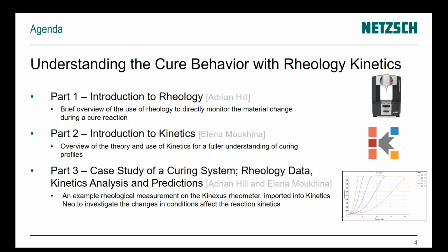So the presentation today, we split it up into three main parts. I'll kick off with the first part, which is introducing rheology, looking at some of the terms, and at what type of measurements we do and how we do them with our Kinexus rheometer. Then my colleague Elena will take on introducing kinetics, bringing you on board with Kinetics Neo, our kinetic modeling software, and saying, okay, what's the theory? How does it work? And what do those results mean when you input this data into this system?